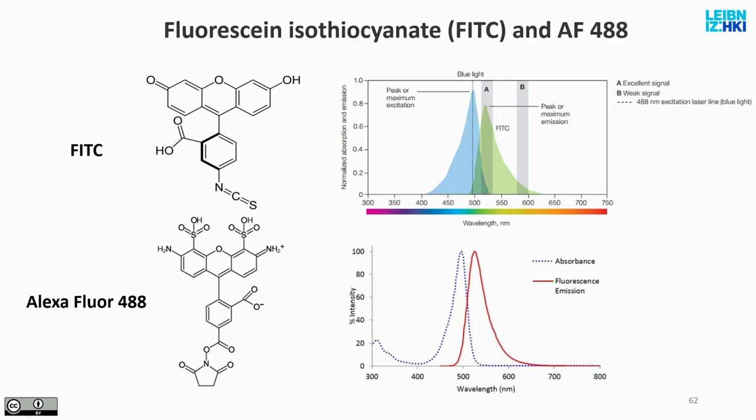of these transitions. So this means that if you take a fluorescence molecule, for example, FITC, which is very commonly used, or Alexa Fluor 488, which are optically very similar, and I ask, okay, what wavelength should I use to excite this molecule? Then I will say, well, this is the so-called excitation spectrum. It's basically a curve that describes how likely it is a photon to be absorbed by the FITC molecule or the Alexa molecule. It says if you use a 400 nanometer violet light, it's not going to get absorbed.